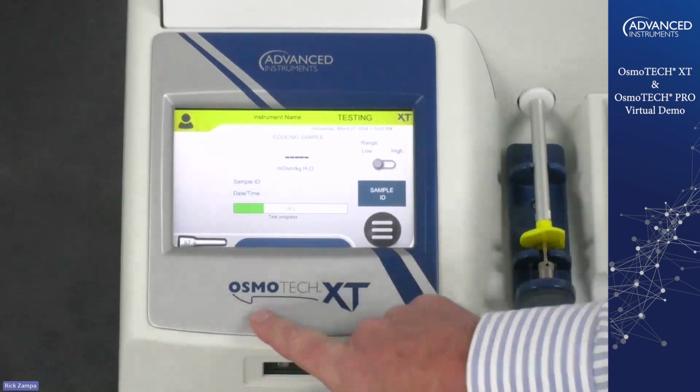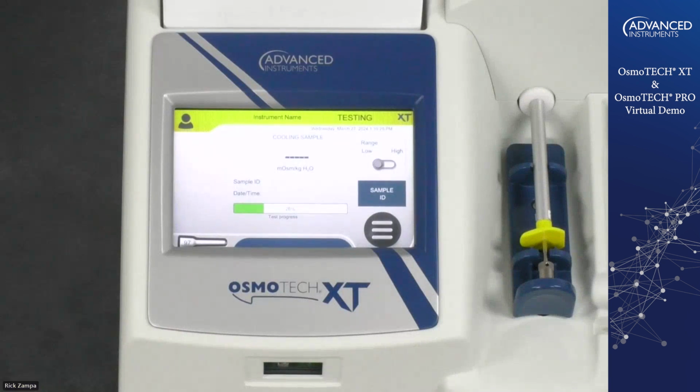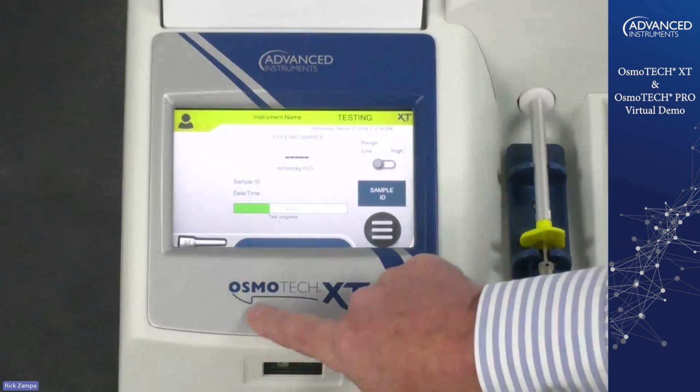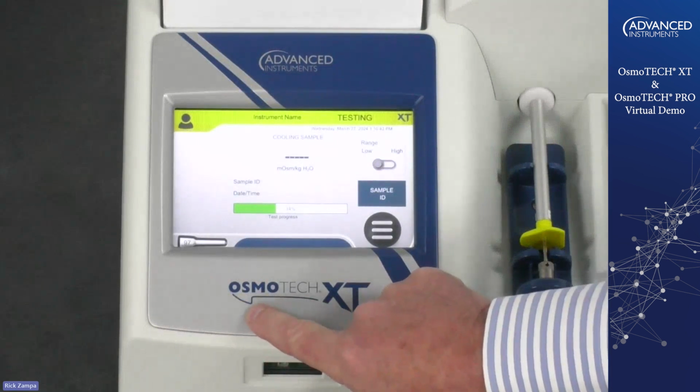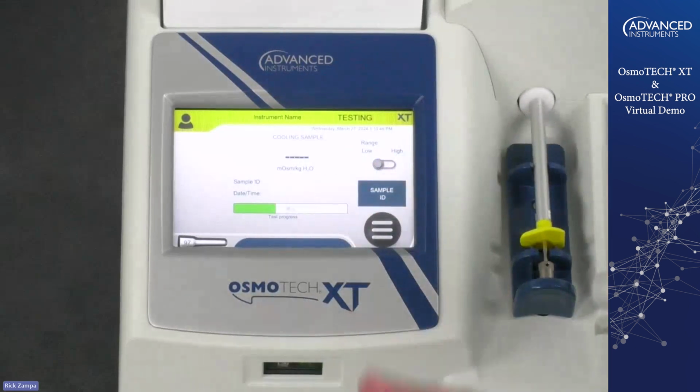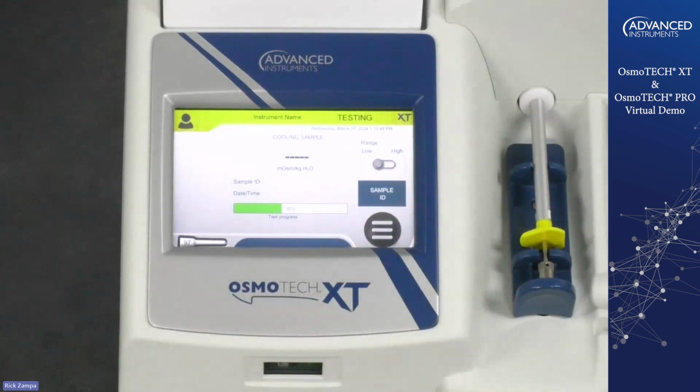We're driving it down through 0 degrees C and through its freezing point. When we get to a set temperature at the bottom of that curve, the sample is still liquid, because we've driven it down through that temperature very, very quickly, and we're assuring that it stays liquid until we want it to freeze. When it gets down to this set temperature at the bottom of this curve here, which should be in our status bar somewhere between 65 and 75% along the status bar, we'll hear a knocking sound.